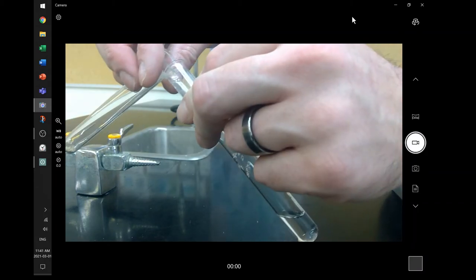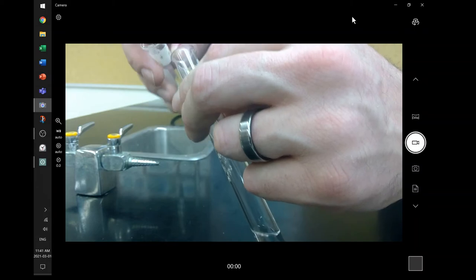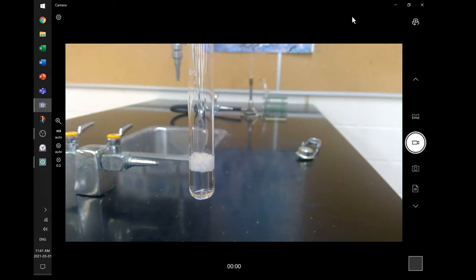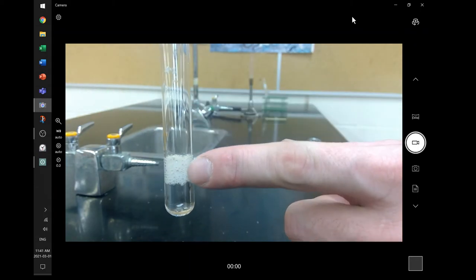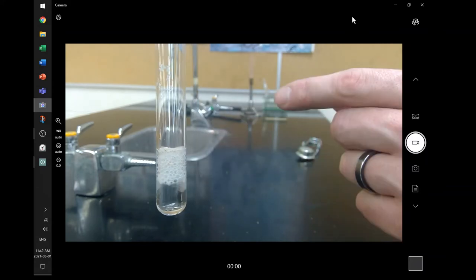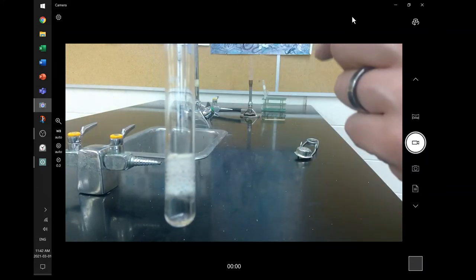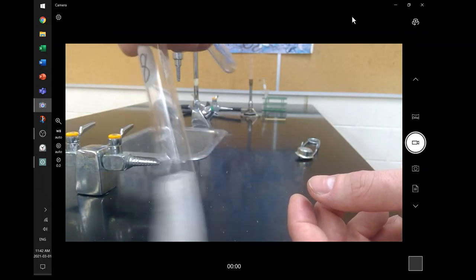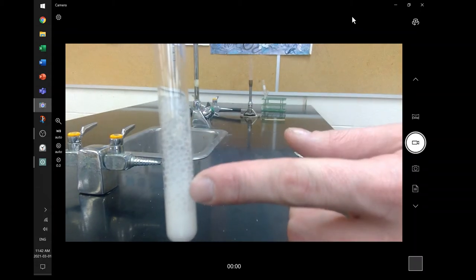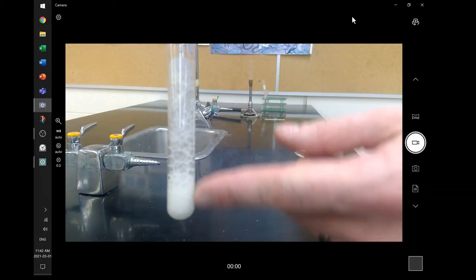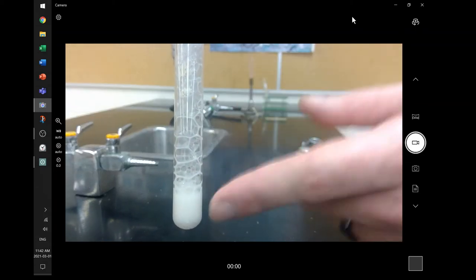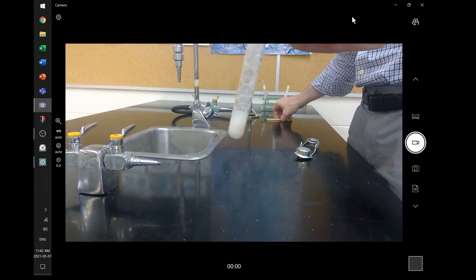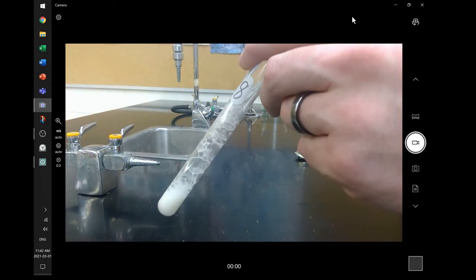So hydrogen peroxide and yeast. I'm going to try my best not to pour them traditionally. This is one where I sort of want to dump my yeast in as quickly as I can without hopefully dropping it all over the table. But I don't want to get it stuck on the side. I want to try and get it right into the test tube as best as I can. And that's a tricky thing to do. The yeast often sticks if the test tube's a little wet. So then I find I get a little bit of a better result if I try my best to mix the yeast into the solution. What you'll notice is lots of bubbles. You see bubbles forming, which is okay. Another indicator for us. You wonder what's in those bubbles. But I do because we want to use our tests to figure out what is in there. What is actually that gas now being made?